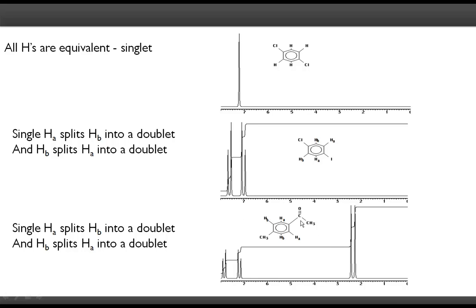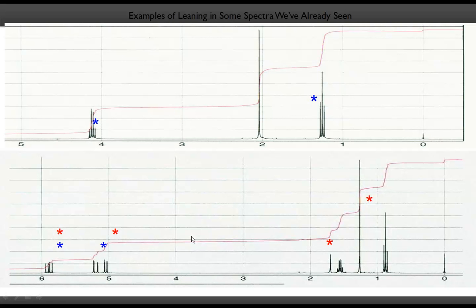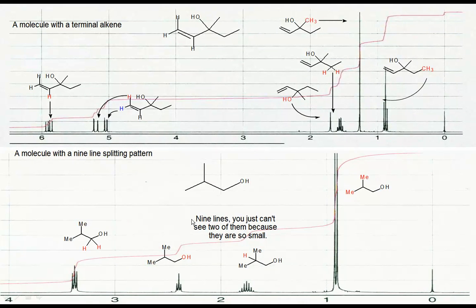And if you have one more substituent, if you have alkyl substituents, not only do you get this pattern, but also you get the peaks for these alkyl groups. Here we didn't have any alkyl groups, so we don't have any aliphatic range. We only have aromatic range. Okay. So let's take another case where we have a different situation.